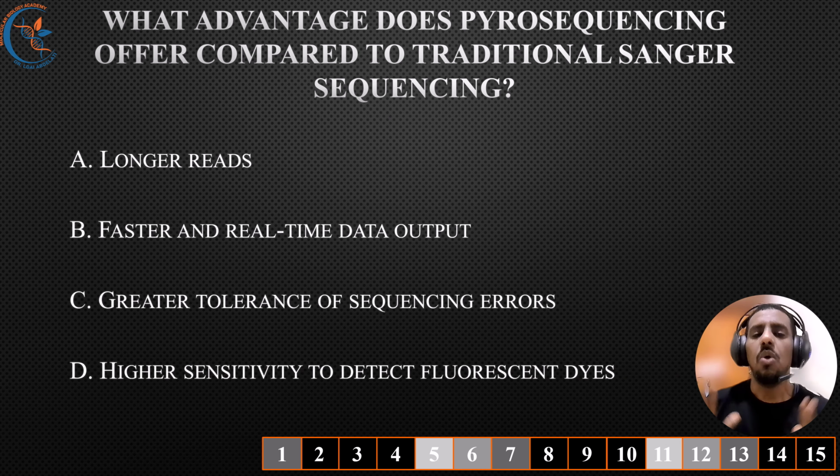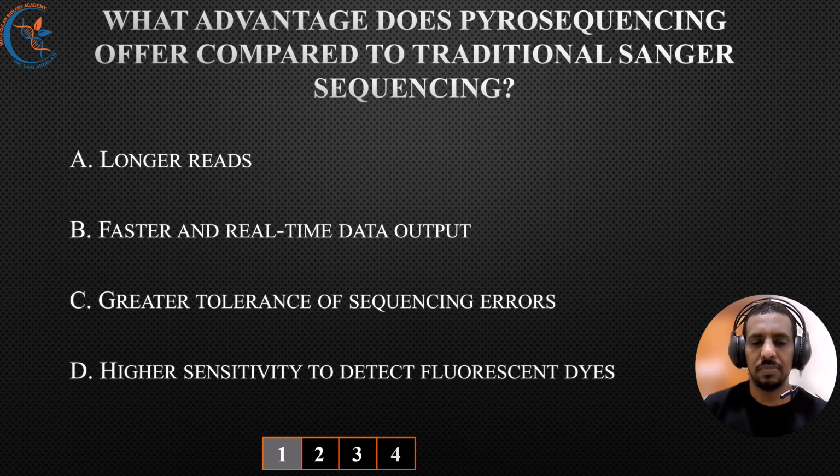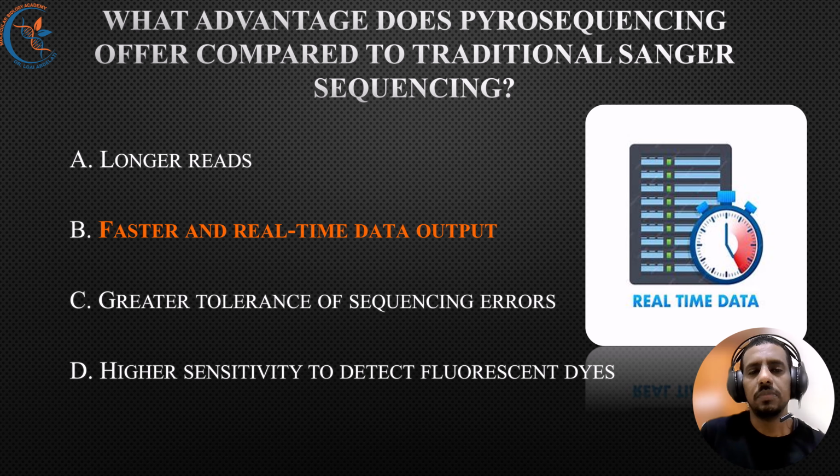What advantage does pyrosequencing offer compared to traditional Sanger sequencing? Pyrosequencing is appreciated for its fast, real-time data generation without the need for electrophoresis or fluorescent dye detection. All right, let's move on.